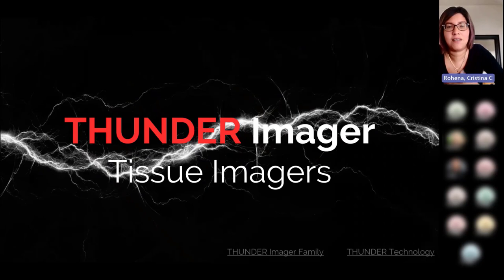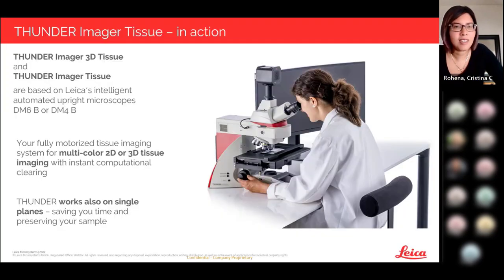I'll move on to our family of upright Thunder imagers. So these are our tissue imagers themselves. We have two different flavors, our Thunder Imager 3D Tissue that allows full motorized Z control, and then our Thunder Imager Tissue for 2D image acquisition. Both of these are based on Leica's intelligent automated upright microscopes, our DM4 and DM6 B line of microscopes. So you now have access to fully motorized tissue imaging with instant computational clearing.